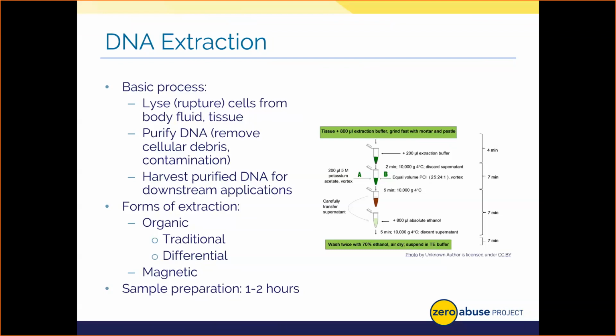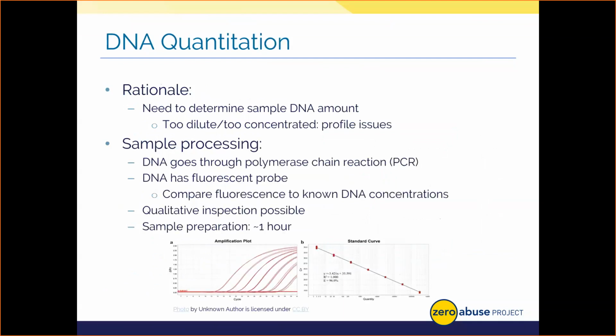All right, our DNA chemistries today have gotten really sensitive, so we've got to be careful with them. Today, we just need a small amount of DNA to generate a very robust DNA profile. If we dip below the threshold amount of DNA needed to get a good profile, we could see certain spots of the DNA drop out and give us a partial or an incomplete profile.